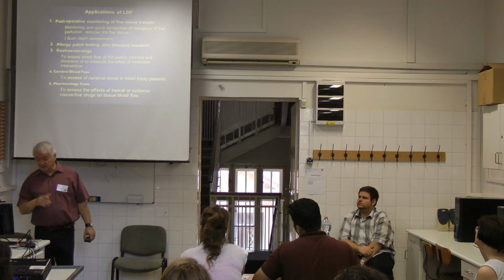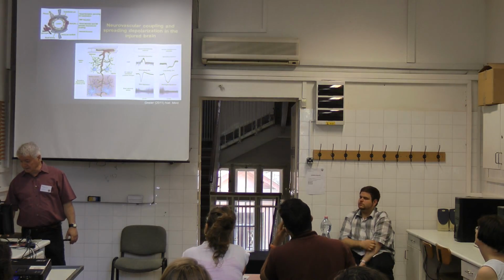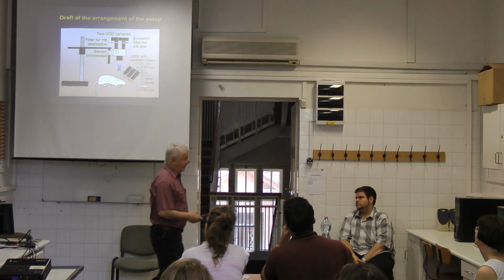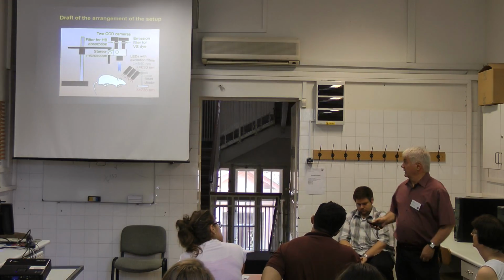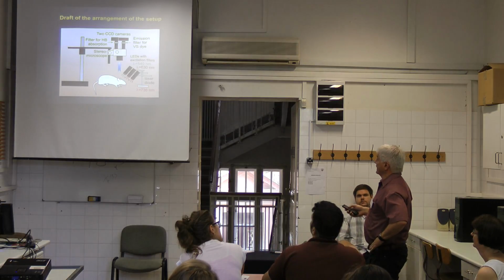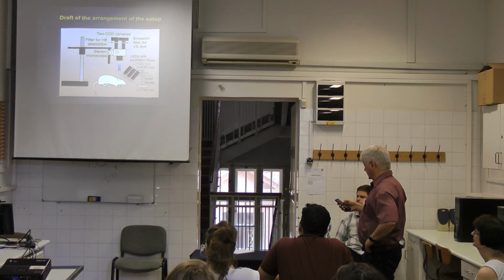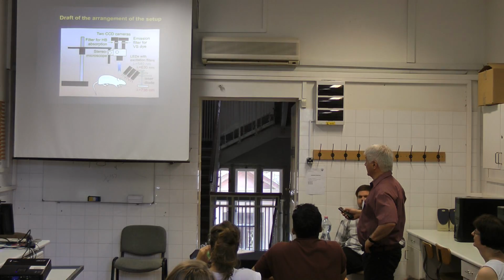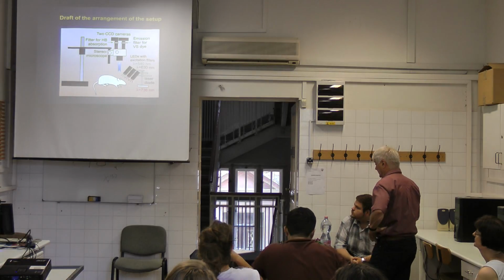I tell you that we developed here in this building, by means of my colleagues, more and more sophisticated methods where we can simultaneously check many variables using laser diodes and LEDs, exciting the brain surface and getting back some images.